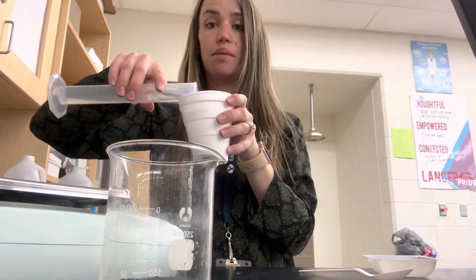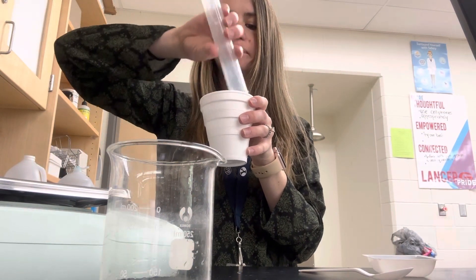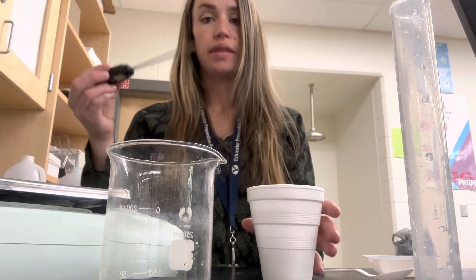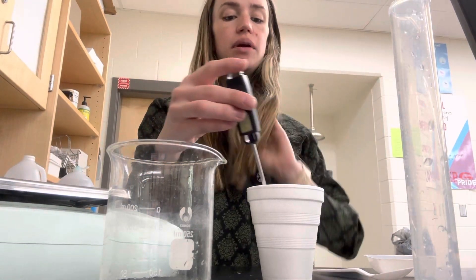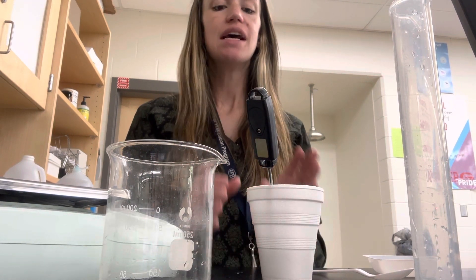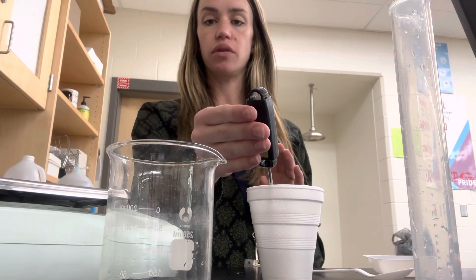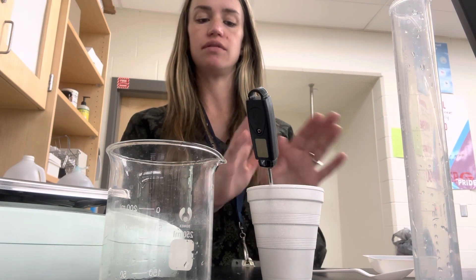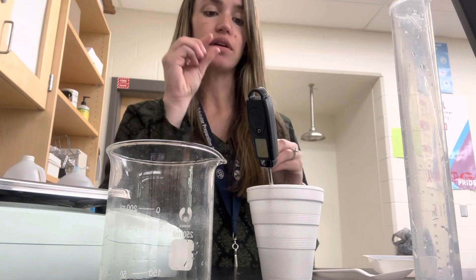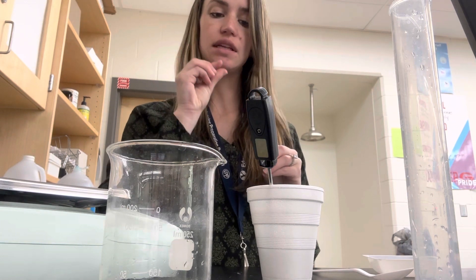Then put that into your styrofoam cup — put your water in the cup first. Then you want to see what the temperature is to start, so put your thermometer in while you do your other tests. Someone might need to hold the thermometer so your cup doesn't tip over. Let it sit in there so it can get the correct temperature of the water, as it will move until it reaches the right point.